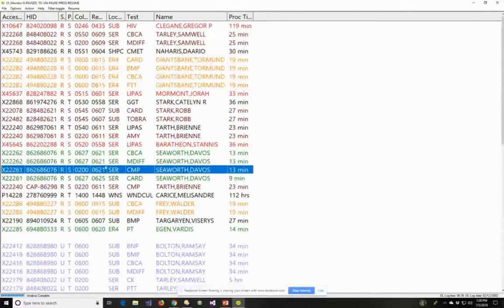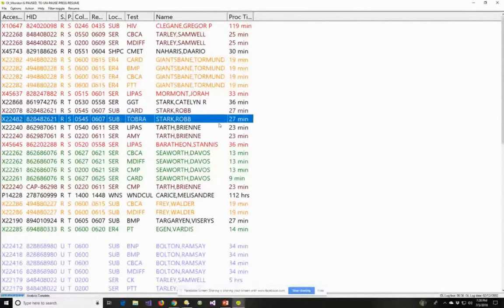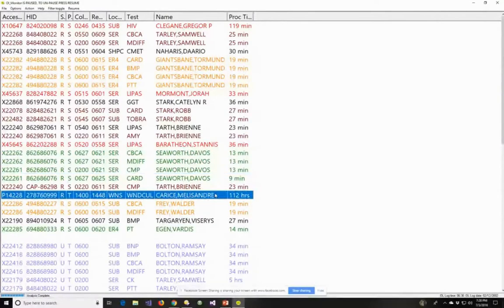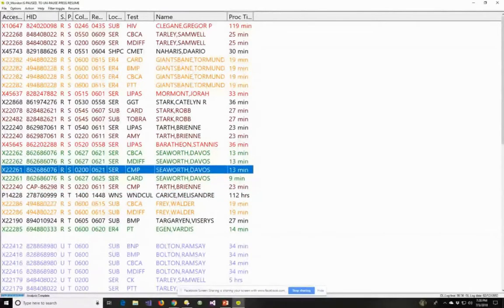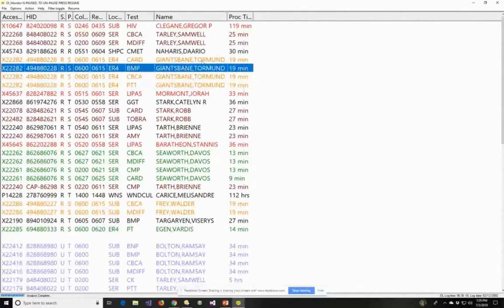So we've got green — green is good. Orange means okay, guys, what are we doing? Dark red means things are looking rough, maybe we need to fix this. Red means it's already overdue, but we can still get it done as quickly as possible and maybe avoid some angry phone calls. Chemistry techs will know that green tests are probably still on the centrifuge, so they don't need to worry about them. But when they see orange, they'll be looking for their tubes and making sure they're on their instrument.